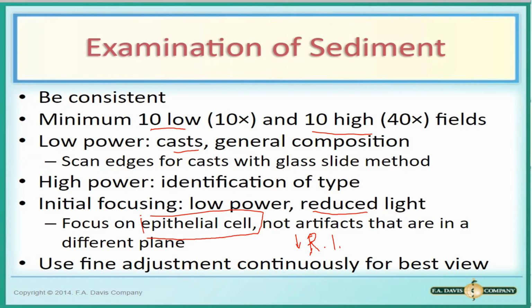Once nakakita ka na ng epithelial cell, you know na nakafocus na yung microscope. Pag wala kang makitang epithelial cell, baka hindi ka pala nakafocus.